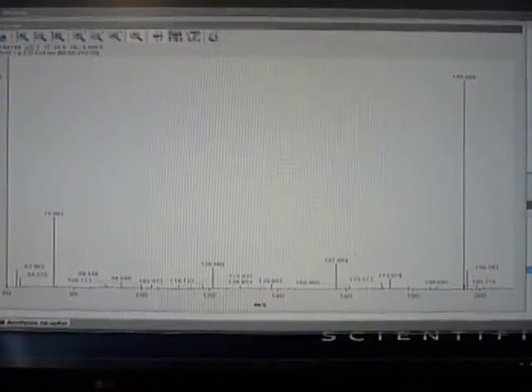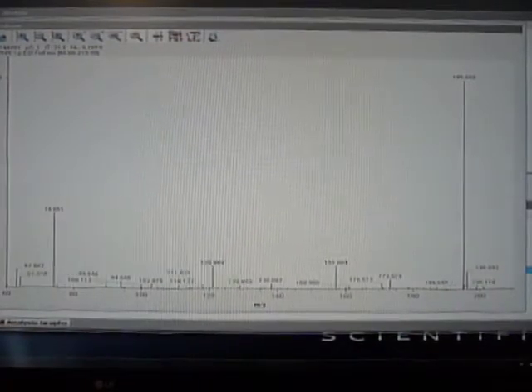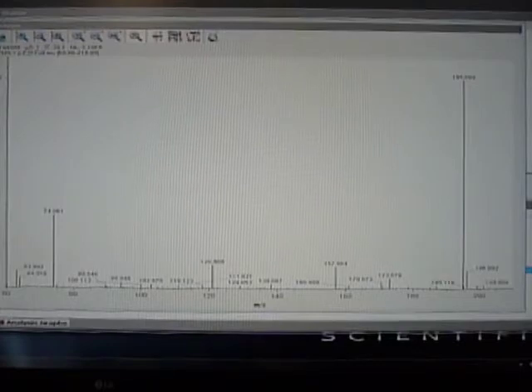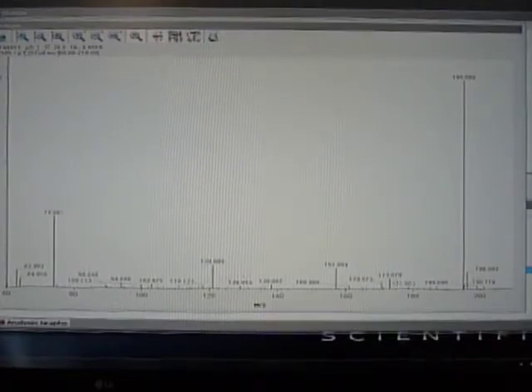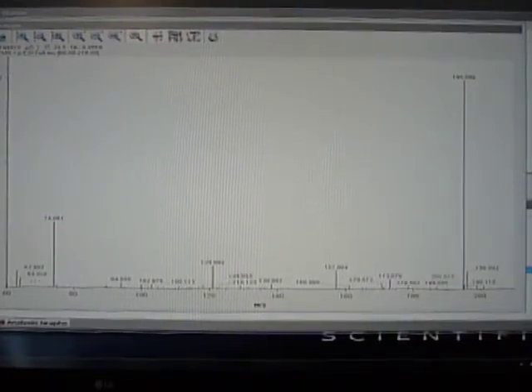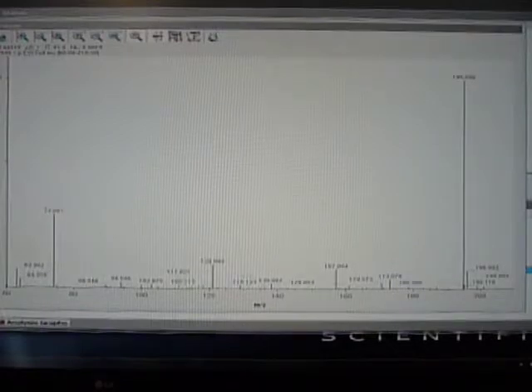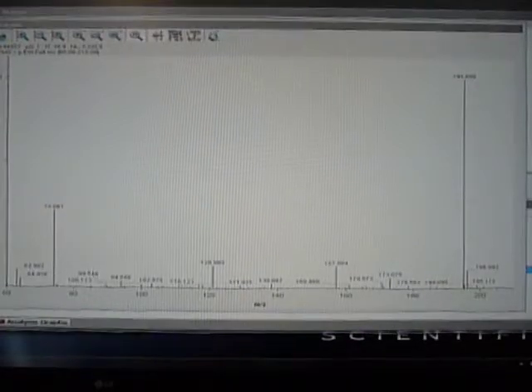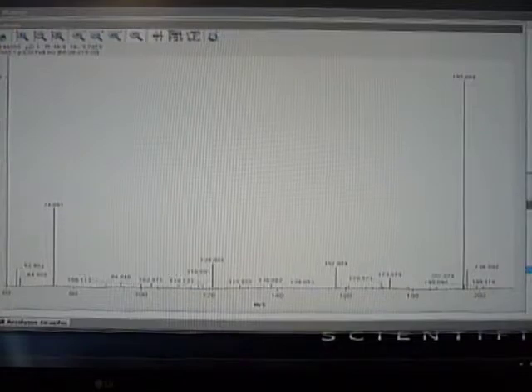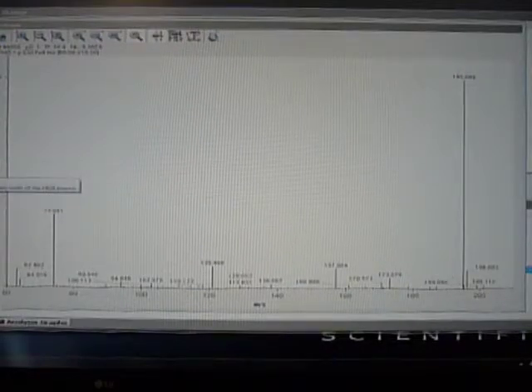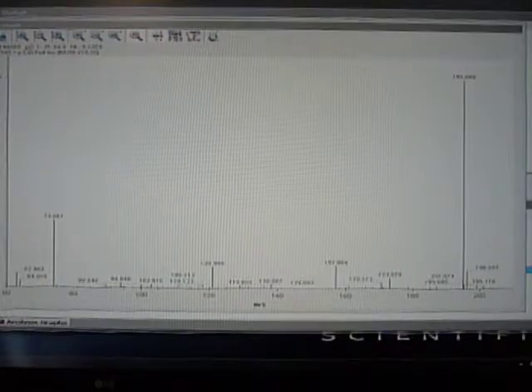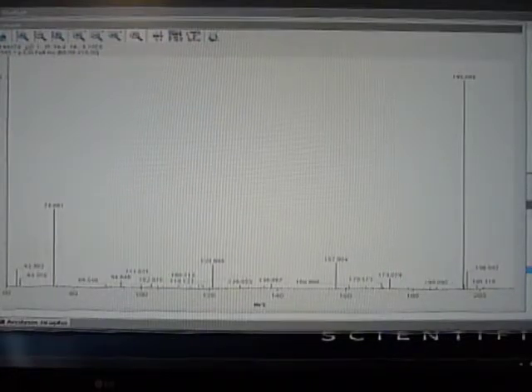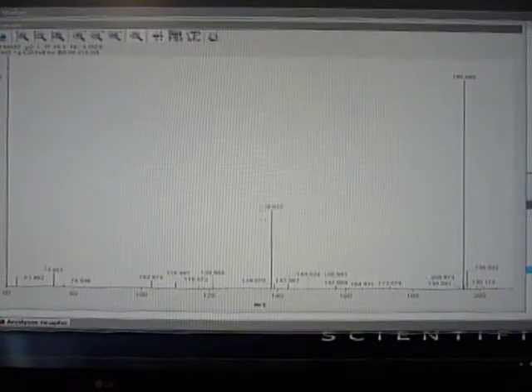And this is reagent grade methanol acetonitrile. At this level, we're going to see some junk. So let's try another trick, and that is, for the sweep gas, I'm going to bump that up to 2, and hit apply, and let's see what happens.